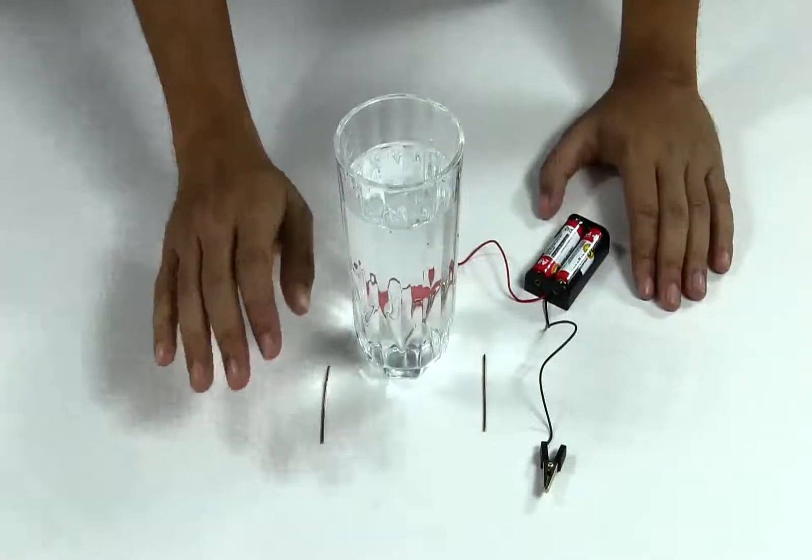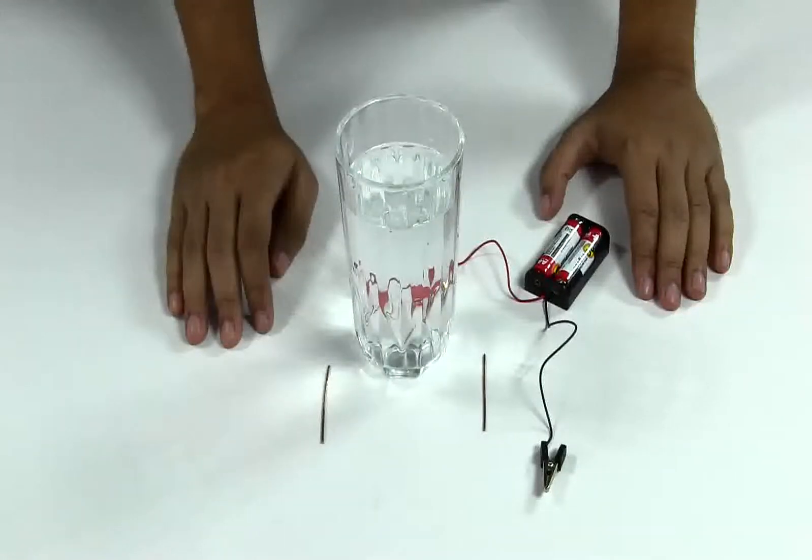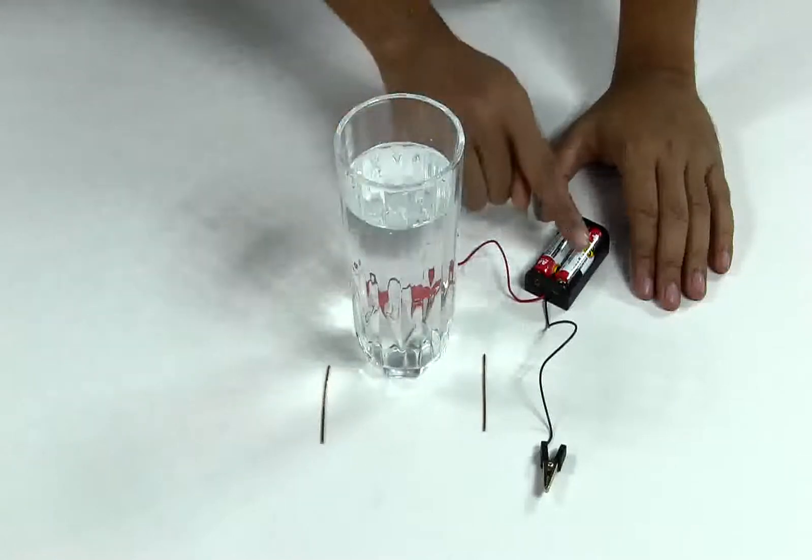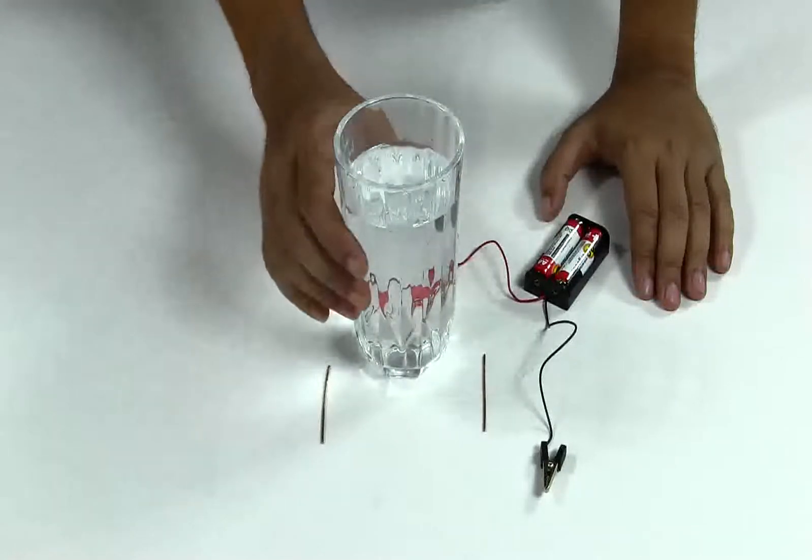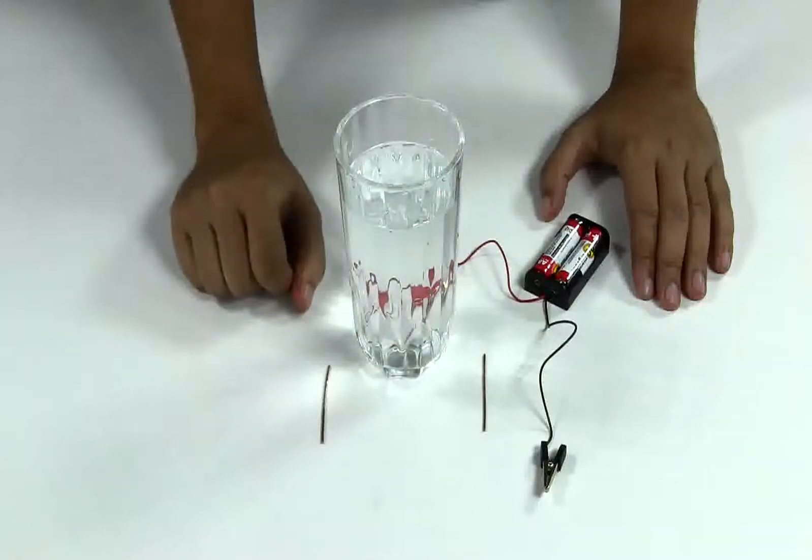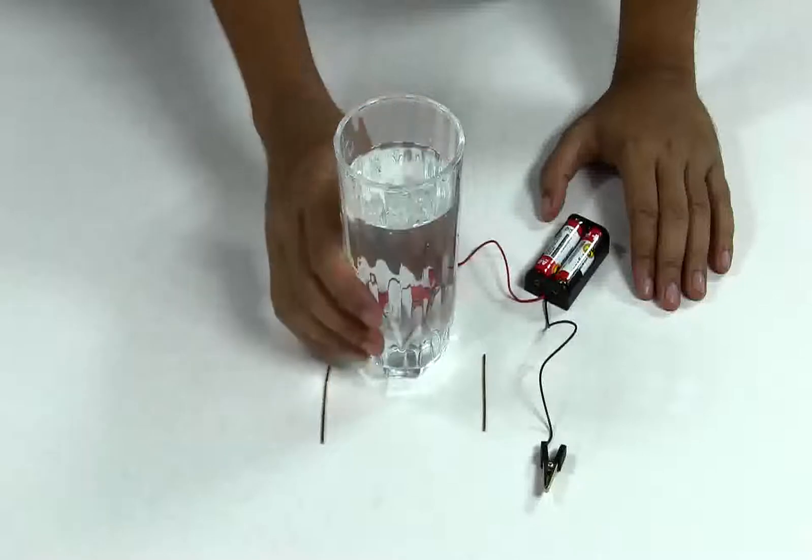In this experiment, we are going to perform electrolysis. Electrolysis means breaking down a chemical by using electric current. Here in this glass, I have diluted some table salt. Table salt is sodium chloride, so in this glass we have sodium ions and chloride ions.